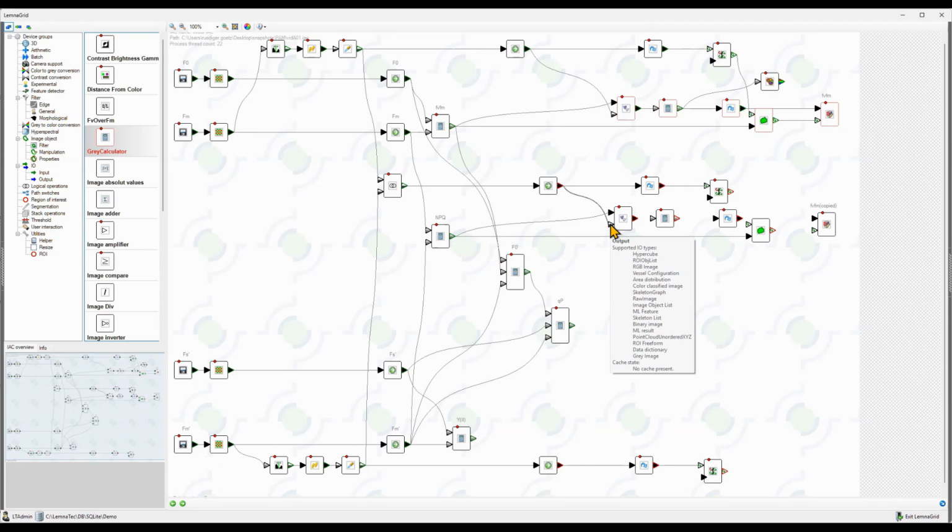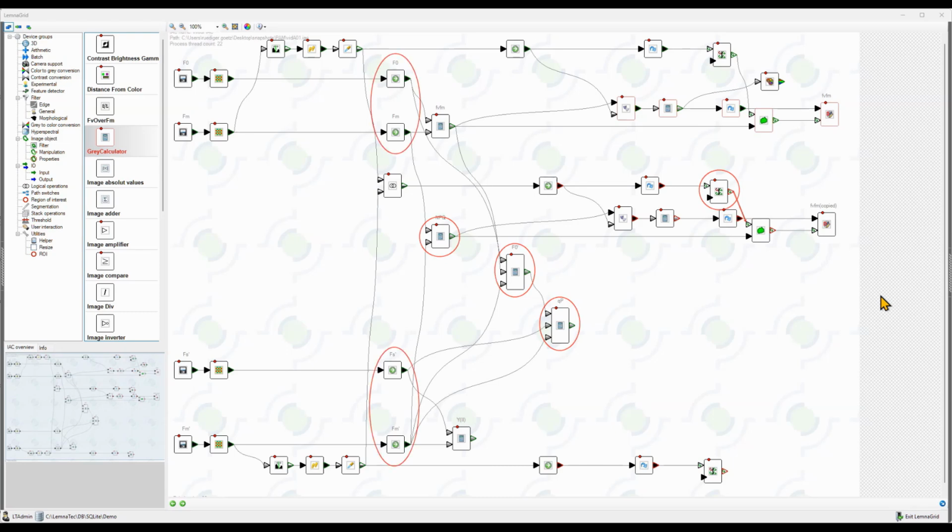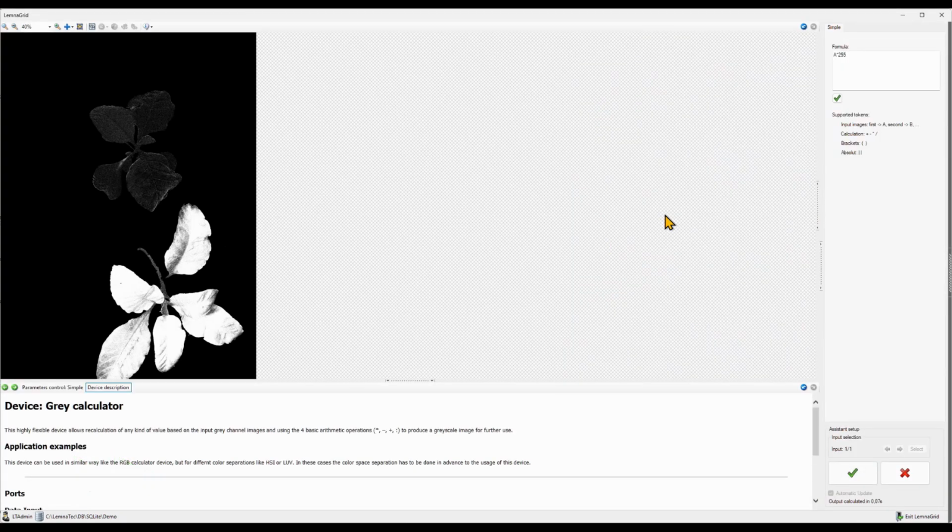As I said earlier, with NPQ, F0', and QP, we use a merged object list from the merged segmentation because they use inputs originating from earlier and later measurements. Since the range of the possible values is different for each parameter, we need to check the amplification factor for each of them. 255 is good for NPQ.